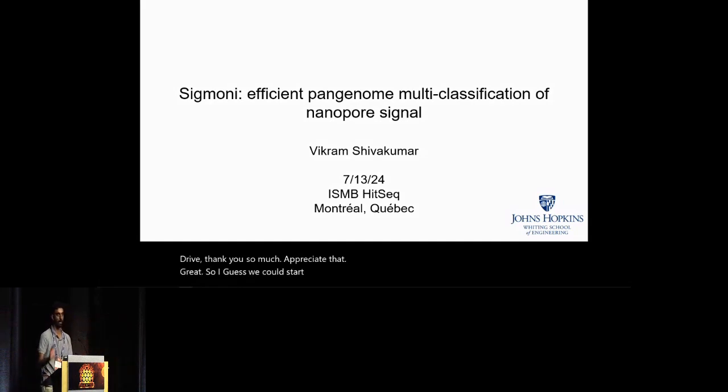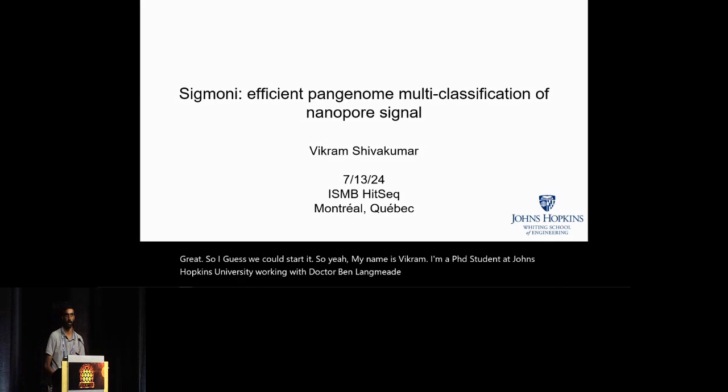So yeah, my name is Vikram. I'm a PhD student at Johns Hopkins University, working with Dr. Ben Langmead. And I'll be talking about a project that we call Sigmoni, which is applying compressed text indexing to the problem of nanopore signal classification.